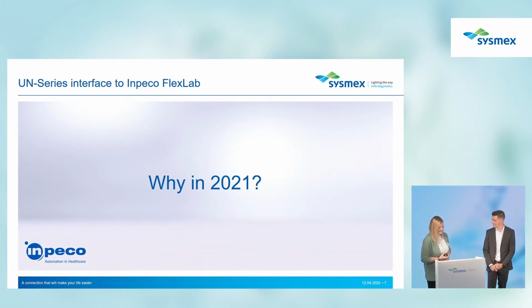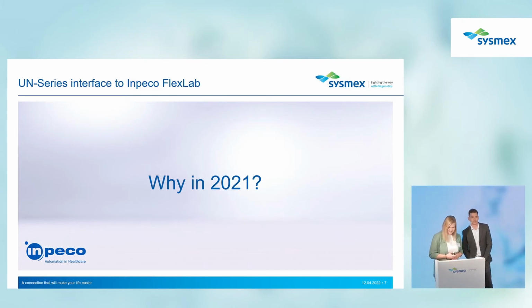Good question. This is really a good question. But the answer could be that urinalysis was always considered, from an automation perspective, an undervalued specialty. It means that the cost per test is very low compared to our other specialties. And so it was not so convenient to invest in automation, because automation in general is able to increase the efficiency in a lab, to decrease costs overall, but you need an investment in the beginning.